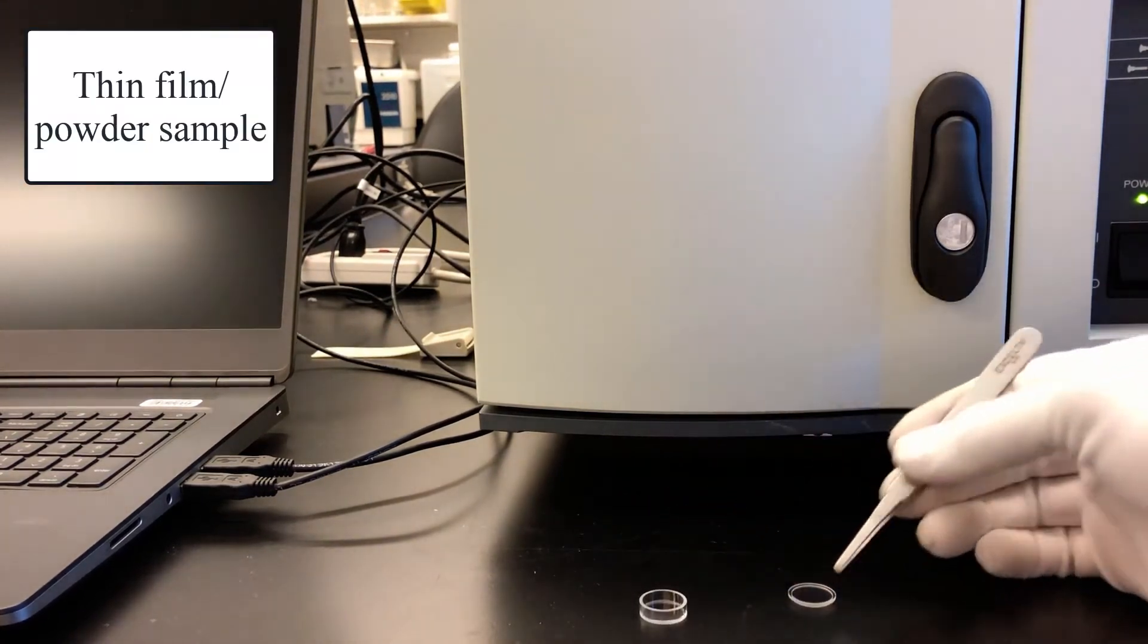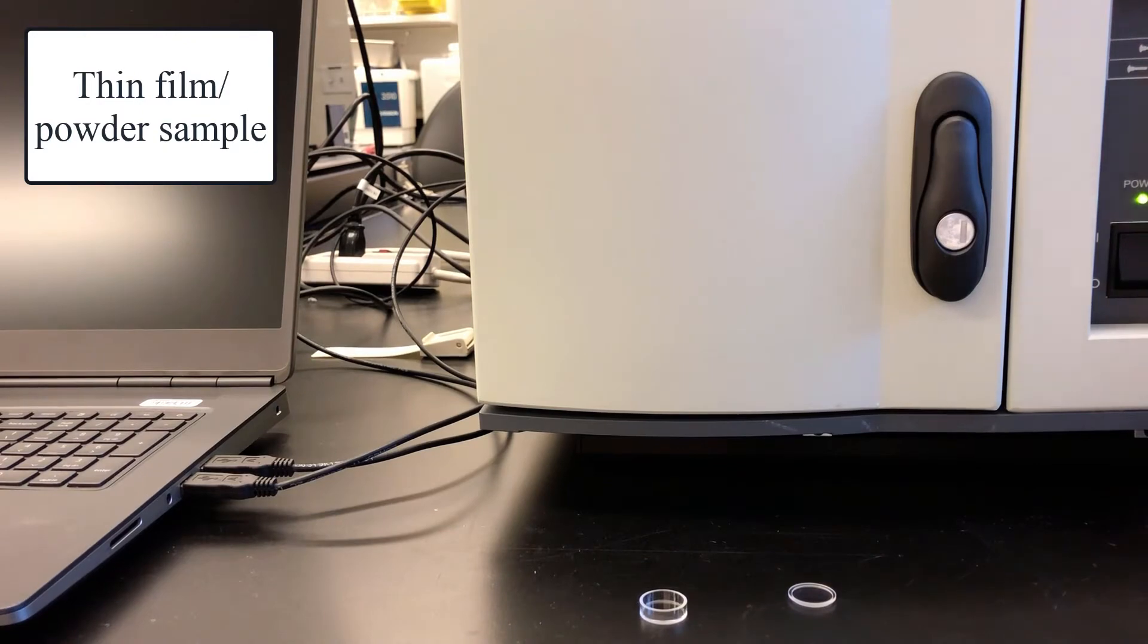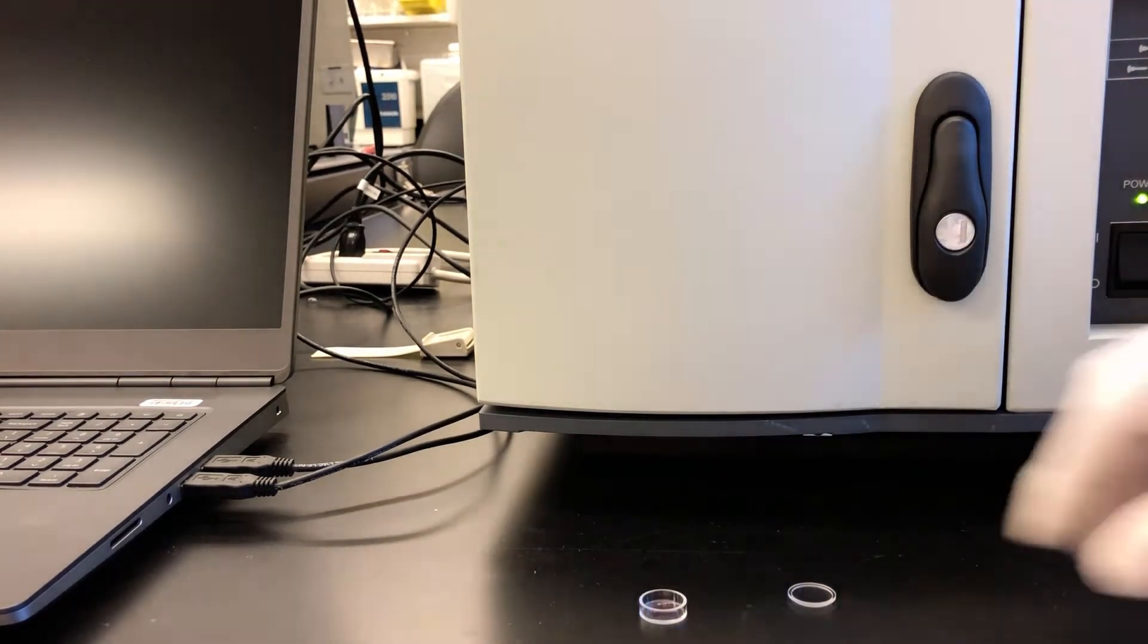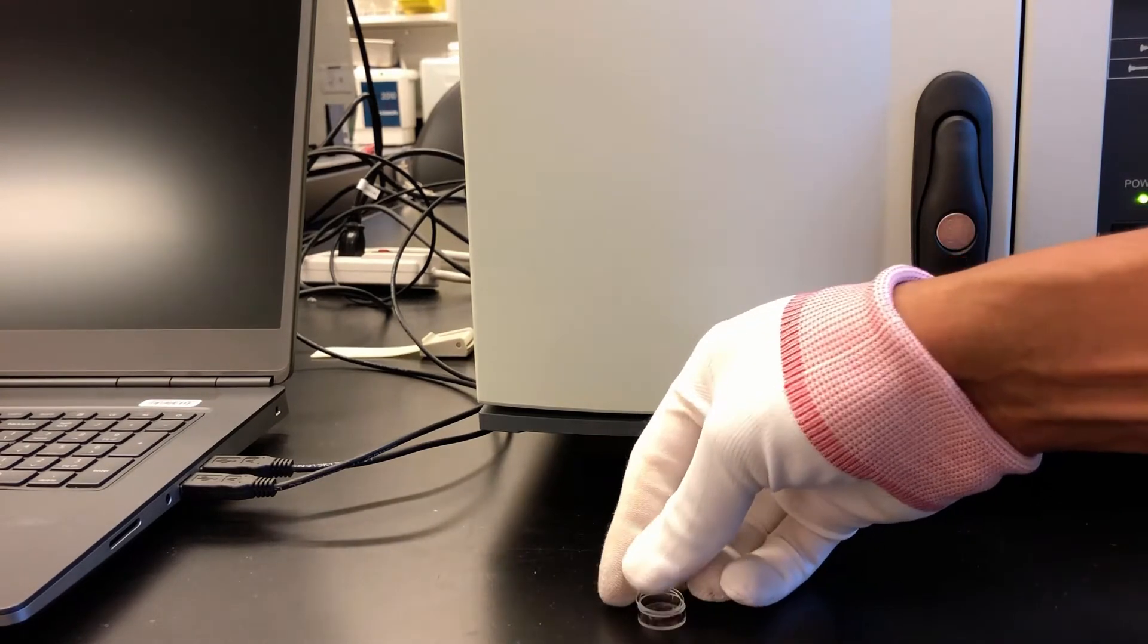Here we have a sample tray for a thin film or powder sample. I'll load up a thin film of the same material, P3HT, and open up chamber B on bottom.